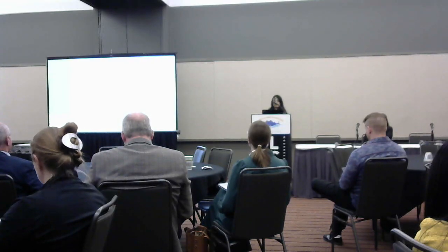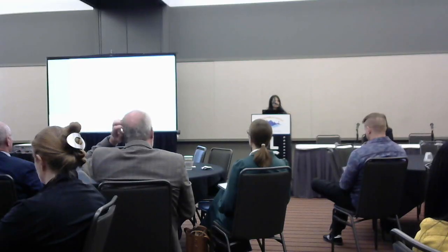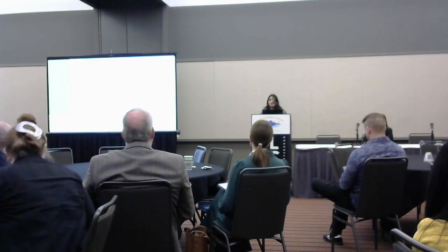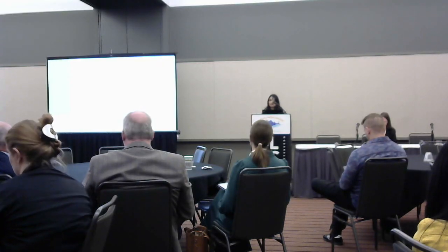And more importantly for us as a core, we are able to come up with an automated reproducible workflow, which can then be shared with diverse groups. So we're trying to move away from one-off tasks on a local machine to something which is more shareable and scalable that can be used by several users.